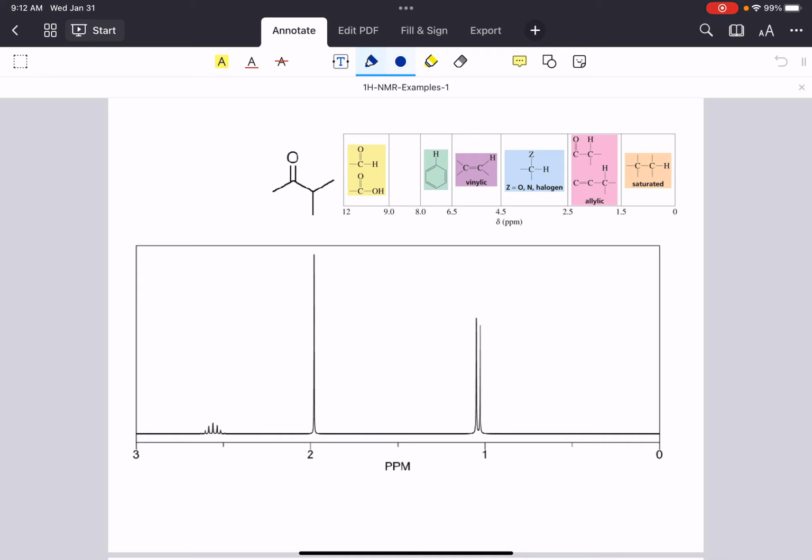If I look, I would pretty quickly recognize I've got a series of hydrogens at this methyl group A. There is a CH group here at B, and then two equivalent series of protons corresponding to those two methyl groups as C. If we think about splitting in terms of what we would expect based on neighbors, we should expect methyl group series A should turn out to be a singlet because it has no hydrogen neighbors on the carbon next to it, so this would be a singlet.